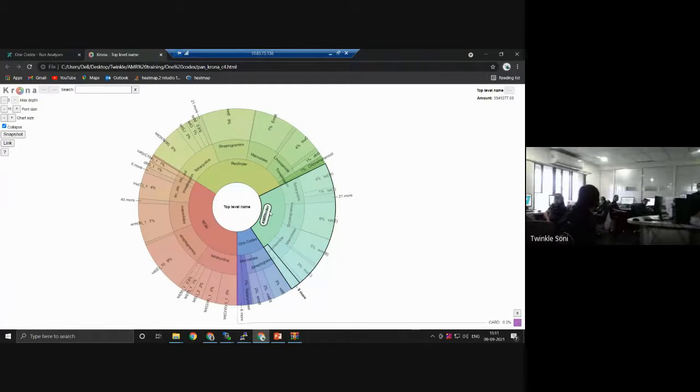You cannot compare two databases. If you want to compare, the results will be different. There is no surety you will obtain the same results from both. You can even see it from here. NCBI is the largest database, so it is showing so many results from the same sample. But One Codex has its own database, so it's just giving this many hits only. For AMRFinder we have this many, and for ResFinder we have this many hits. So that's what the paid analysis is about. One Codex paid will give you results like this.